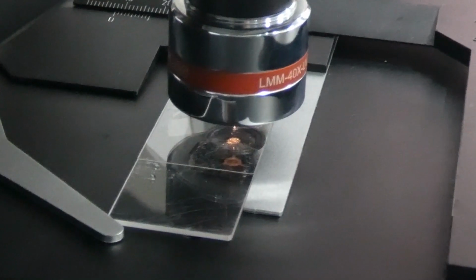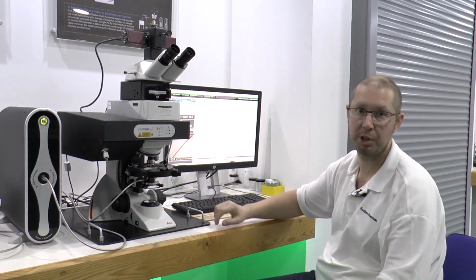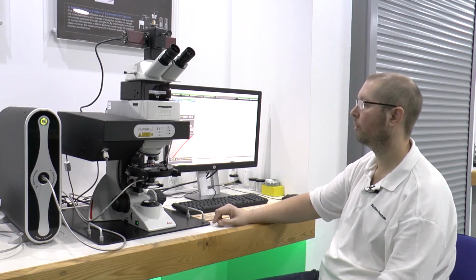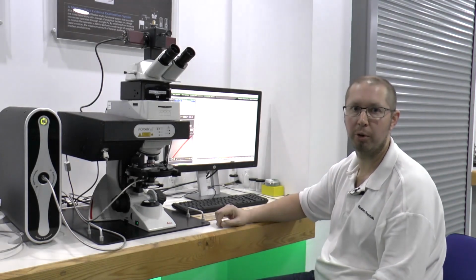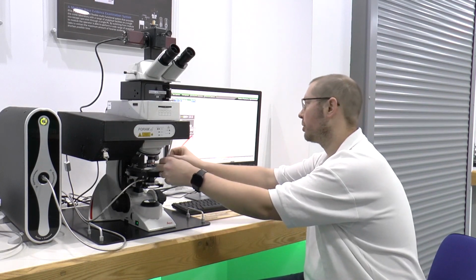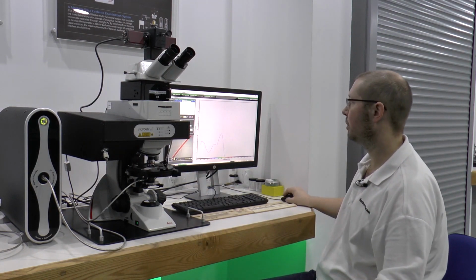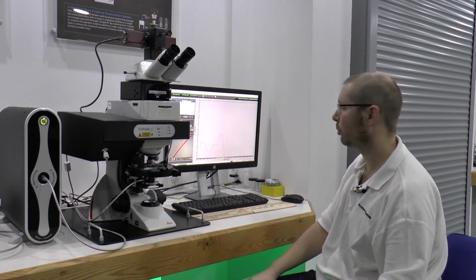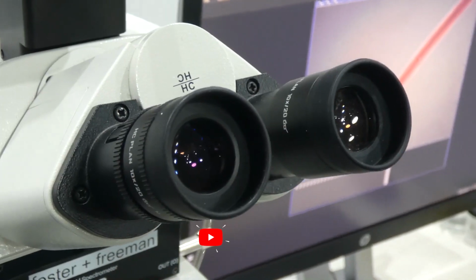The measuring aperture depends on the objective that's used. For the UV system we use a 40 times reflective objective, and our sampling aperture is approximately 1.25 microns. So because of that, we're going to have to take a few repeat measurements of the sample just to build up an idea of the range of variation that we're seeing across the group of fibres.